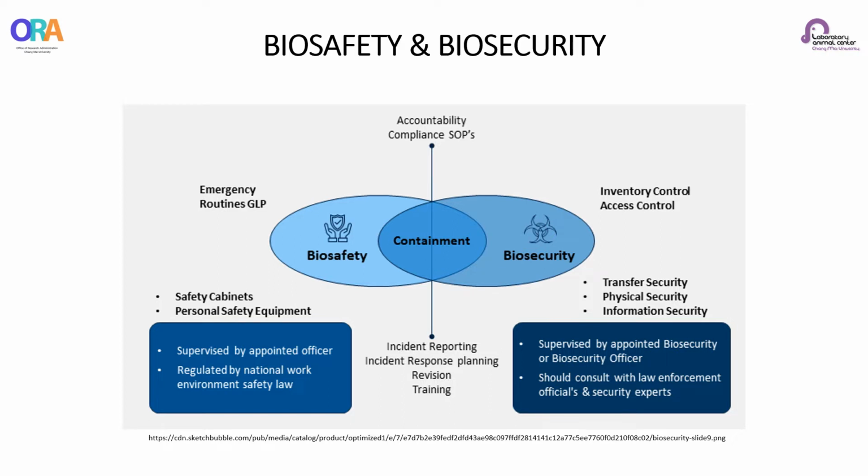Biosafety programs reduce the exposure of workers and the environment to hazardous biological agents. This is achieved through containment, laboratory design and access restrictions, training personnel, and safe methods of using and storing hazardous agents. Biosecurity programs may also use these methods.